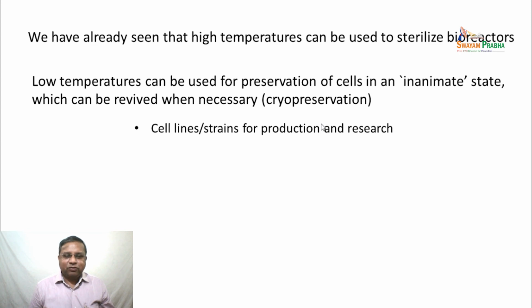Whenever the power goes down, one of the biggest concerns is the minus 80 degrees C freezer: is that going to get affected? When we designed our buildings, we had to ensure that we had dedicated power lines which were supported by the UPSs and so on, so that there would be continuous power to those minus 80 degrees C freezers. So it is rather crucial, and it is done all the time.